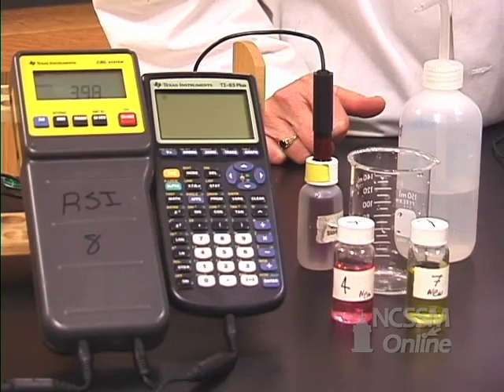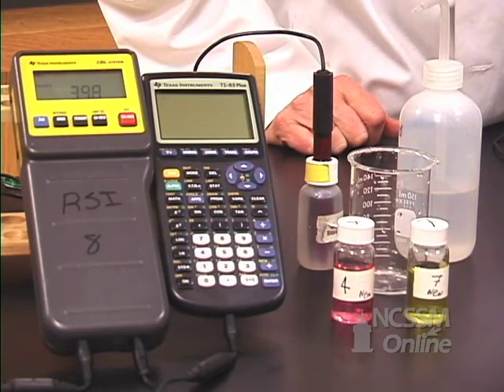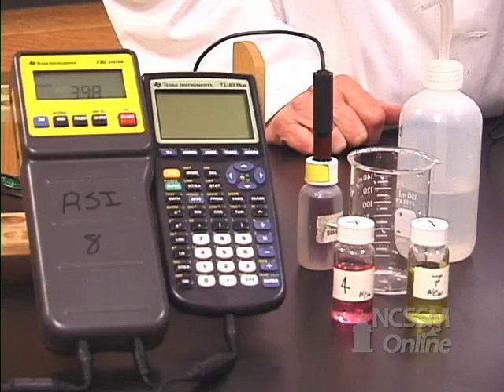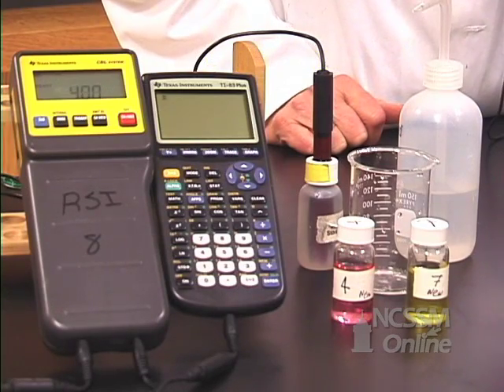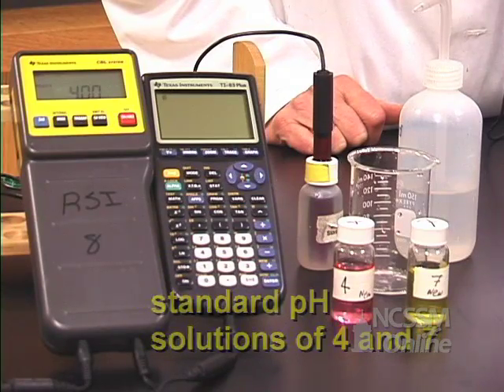You're going to be using a CBL and a calculator. The first thing you need to do is connect the CBL and the calculator with a link cable. Then find your pH probe and plug it into channel 1 at the top of the CBL. You'll need a standard pH 4 and 7, or 4 and 10, to do the calibration.